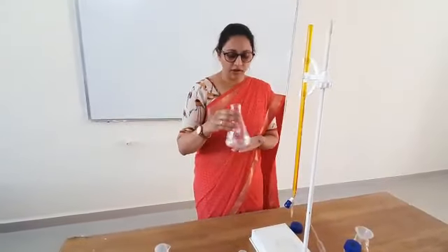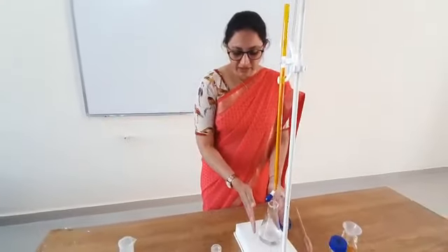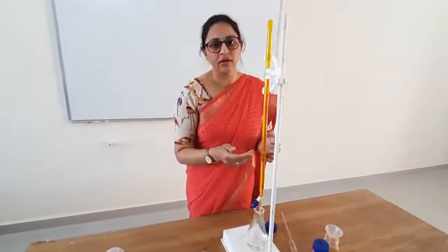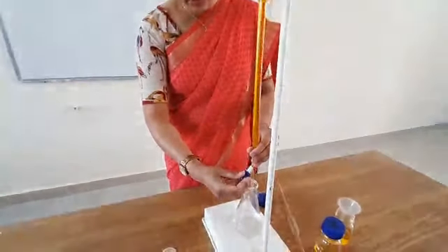This is our reaction mixture, or analyte. We will now titrate it with the potassium dichromate. In this practical, the ferrous ammonium sulfate is the known solution and the dichromate is being standardized. I will now loosen the burette knob to begin the titration.